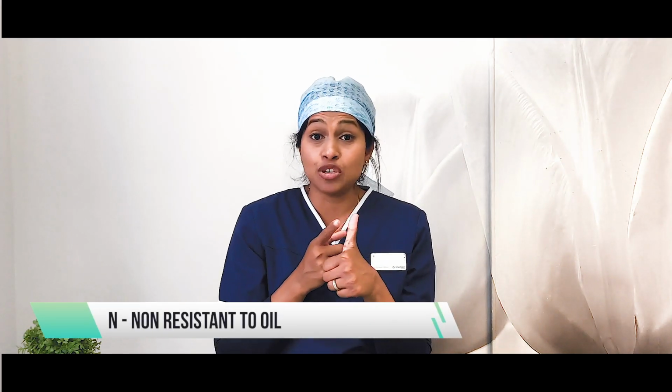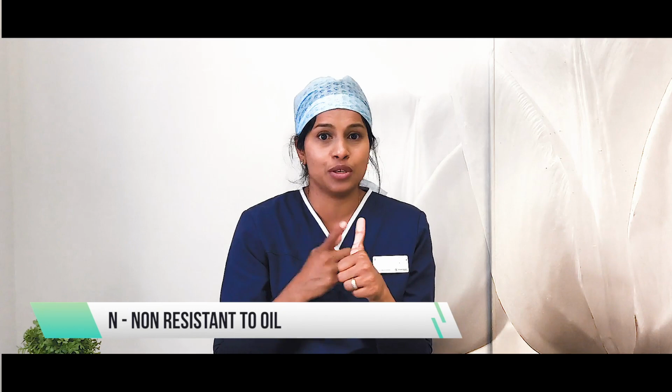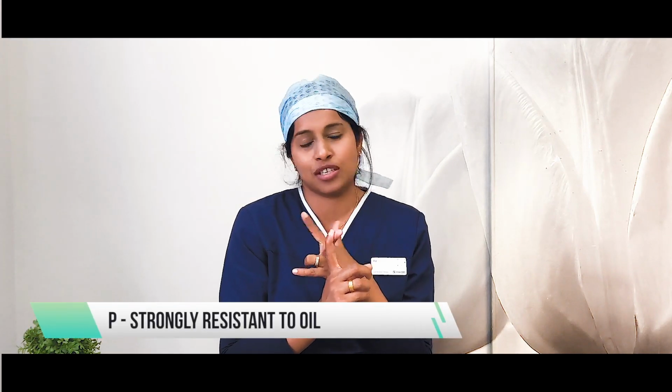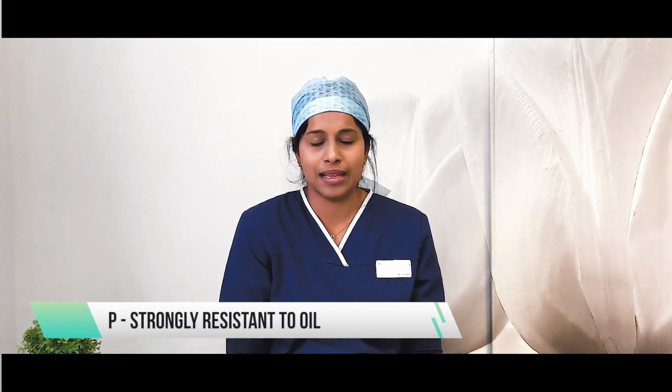Now in the American standards, you also see here this number N or R or P. N means that it is non-resistant to oil, so you cannot use it. Like I said, it was meant for other industries, so it's not really relevant for us. The R stands for relatively resistant to oil, and P is strongly resistant to oil, but it's not applicable to us, just for your own understanding, it'd be good for you to know.